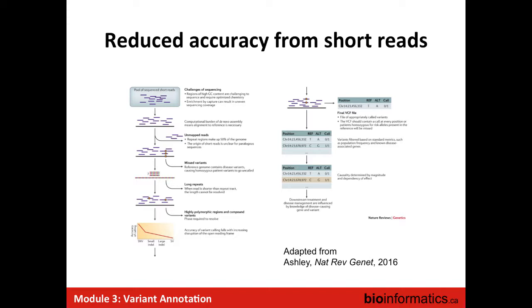So this is in terms of the actual coverage. There are lots of other challenges associated with using these next generation sequencing technologies for variant calling. Mathieu touched on that a bit, but there are again blind spots, because these reads are short reads, so that has an impact on whether you're able to map them uniquely on the genome. So you've got regions where you're mapping to the reference genome.